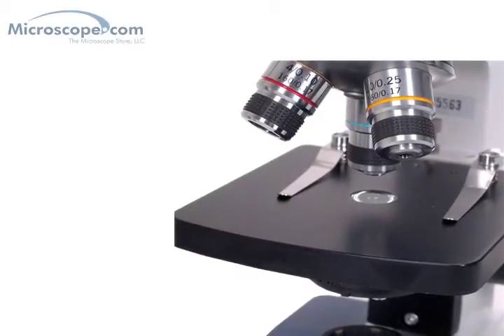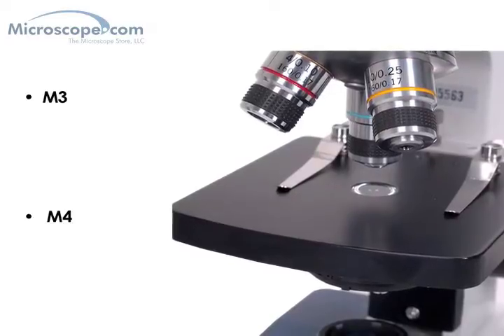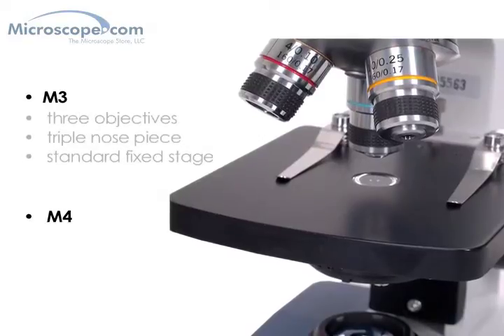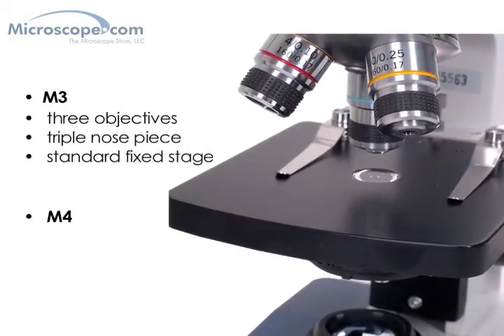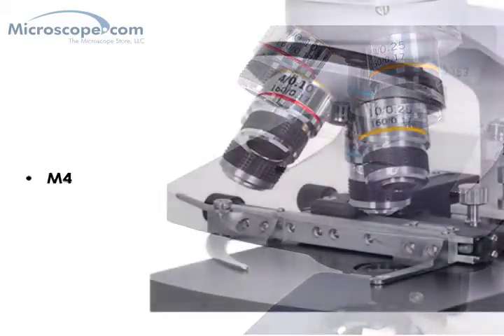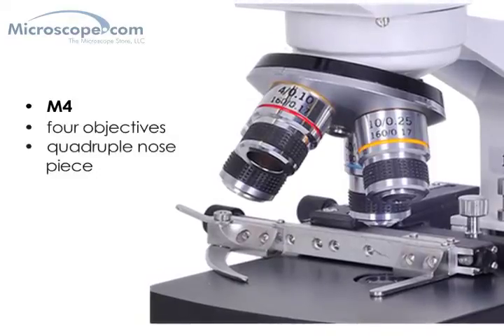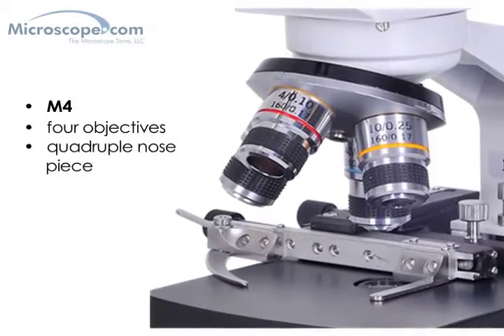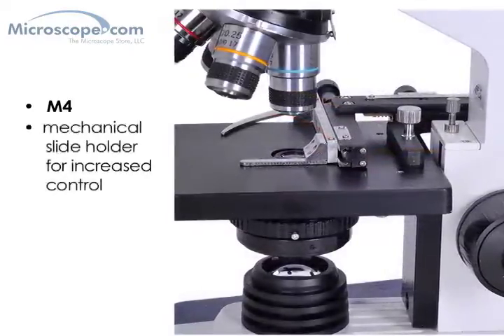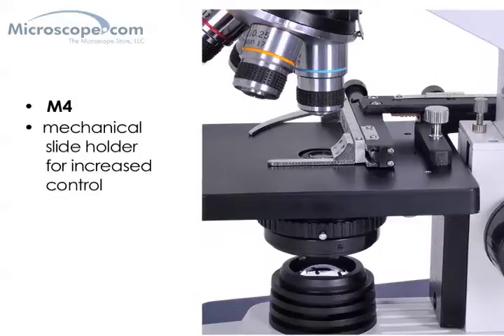There are two monocular microscopes in the 118 line, the M3 and the M4. The two main differences between them are the number of objective lenses and the type of stage. The M3 has three objectives and a triple nosepiece with a standard fixed stage to hold your slide specimen. The M4 has four objective lenses and a quadruple nosepiece, and also adds a mechanical slide holder which allows the user to move the slide around the stage in a controlled way without touching the slide directly — that's a great feature.